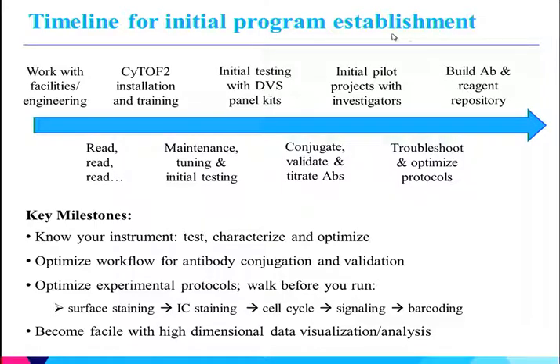And a lot of this, I think, is best accomplished through initial pilot projects with investigators. So here, these are individuals who don't necessarily expect that every experiment is going to work off the bat, and are willing to contribute the resources to really allow you to optimize a lot of these workflows. And in the context of doing these projects, you familiarize yourself with all of these various aspects, and also end up building the repository that ends up being broadly useful to the community as a whole. And in developing some of these protocols, it's a good idea to start slow with things that are fairly simple before you try and do what Aaron does, just because he makes it look easy, but it isn't.